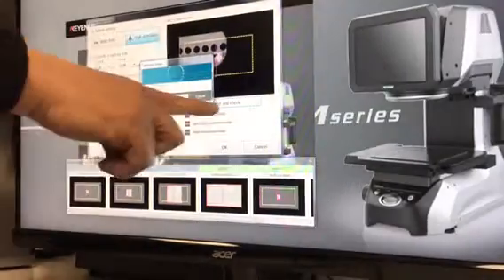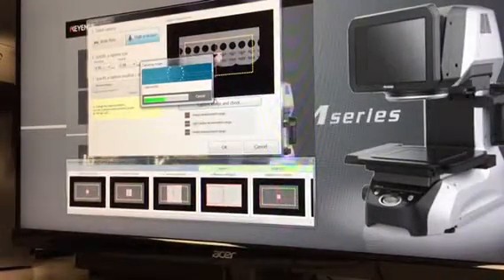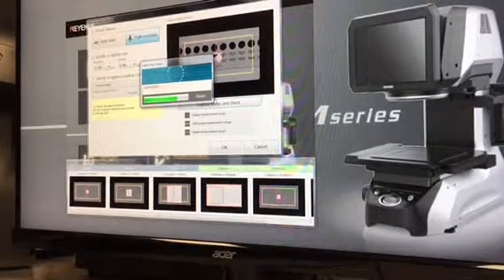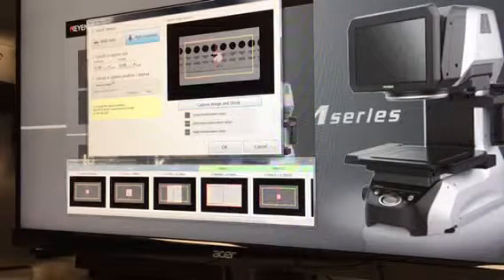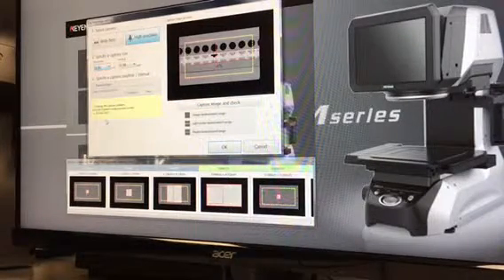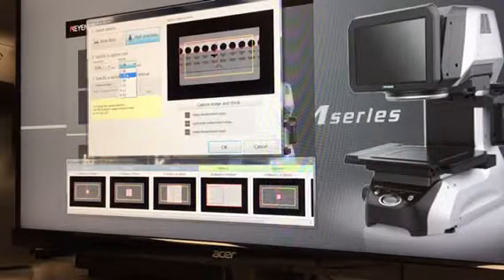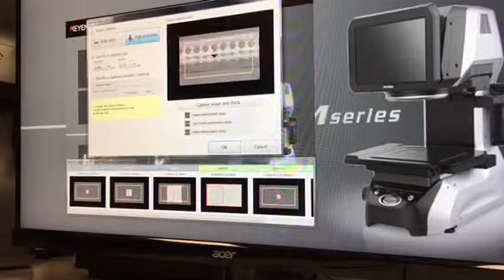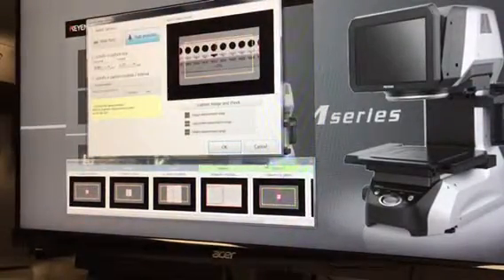Oh, is that it? Okay. So I didn't check that hit one. Capture image and check, and then it gives me this guy right here. And now what I can do is, okay, give me as much horizontal as I want, and I can click where I want it to be. Okay, I see. So now you don't have to waste your time with all of that stuff.